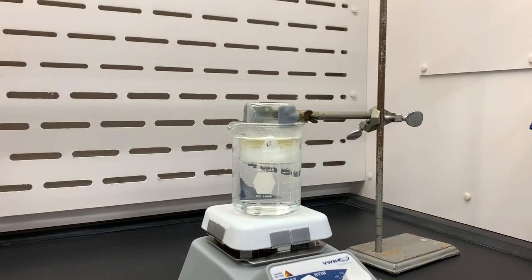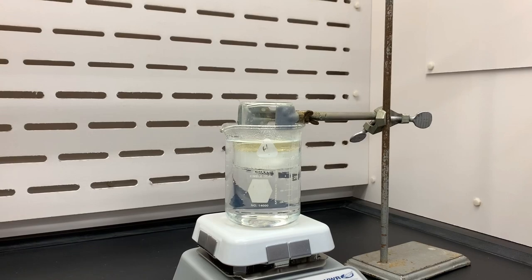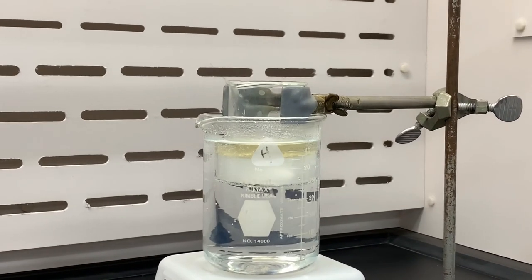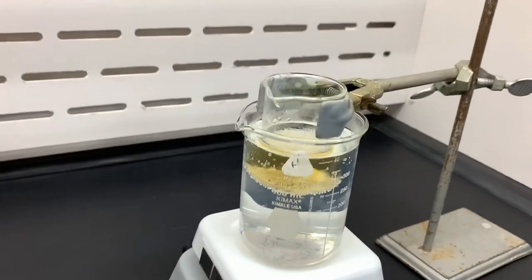Here you should be able to see the two layers — the oil layer on top and then the aqueous layer on the bottom. And after a while, and with good stirring, the layers go away. This is because the reaction is proceeding, and now they're not two separate distinct layers because of their polarities.